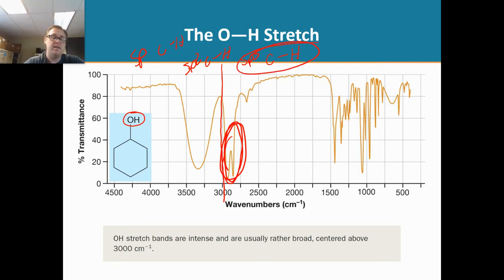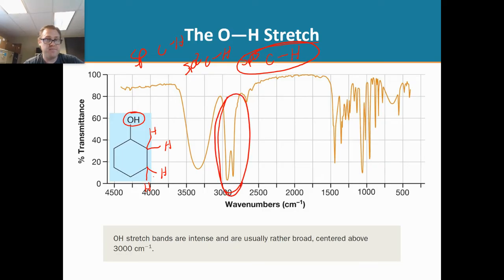that has to be sp3 carbon-hydrogen stretches. And lo and behold, look what we have here. On all these carbons here we have carbon-hydrogen bonds which are going to stretch, and that's where you're going to find them. Isn't that cool?